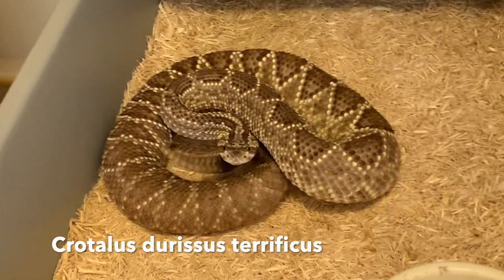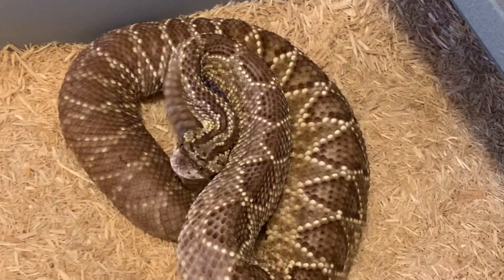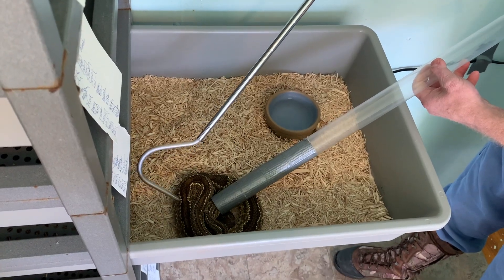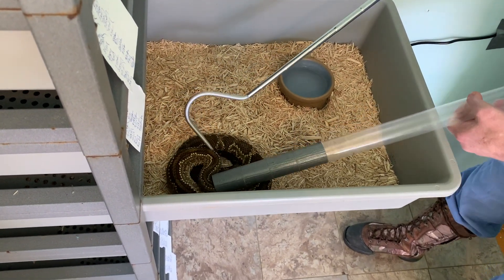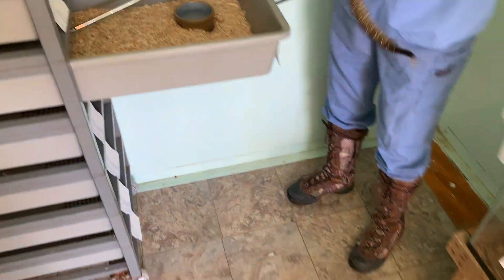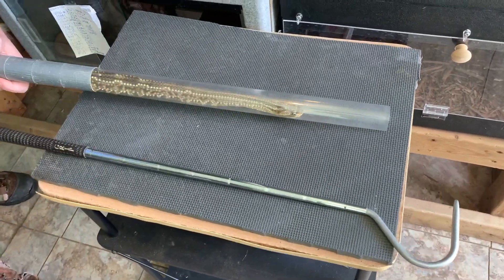This is a South American rattlesnake, Crotalus durissus terrificus. Here's a close view while we get ready to see the extraction. These snakes have a small head and neck and a large body — they can thrash around and injure themselves. So we use this tubing technique that you see Jim doing here to restrain the snake's body. This makes it safer for the snake and for Jim.